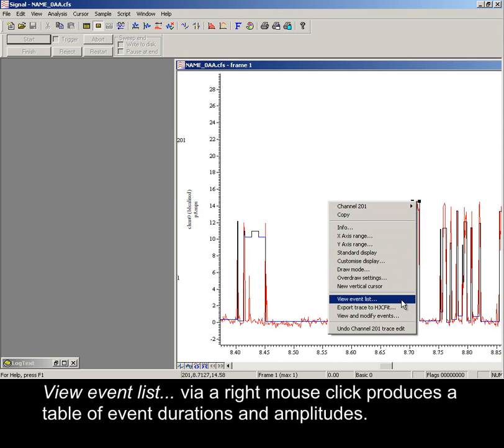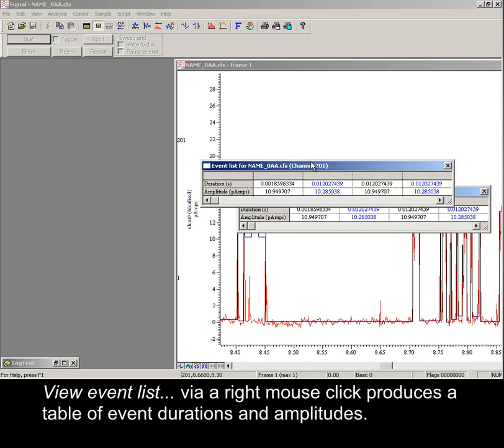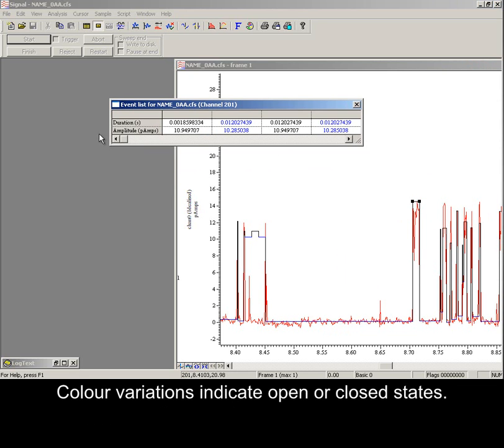View event list via a right-mouse click produces a table of event durations and amplitudes. Color variations indicate opened or closed state.